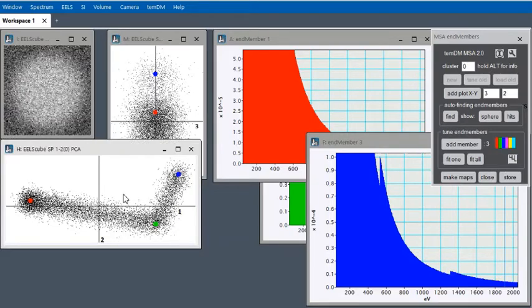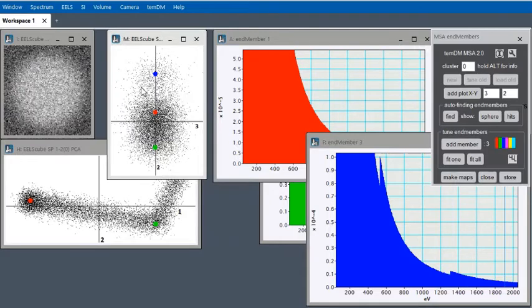In this particular case, it probably doesn't make much sense because all meaningful variations can be described in this plane, which corresponds to this line in this second scatter plot. But still we have a third dimension, and in principle we can drag our markers into this third dimension and see what happens. But right now we don't need that. It's just to show you this option.